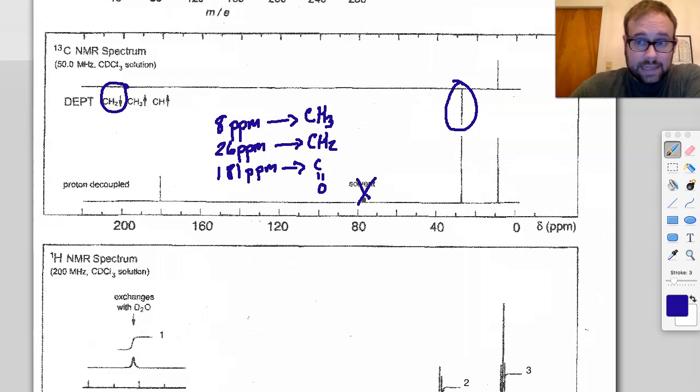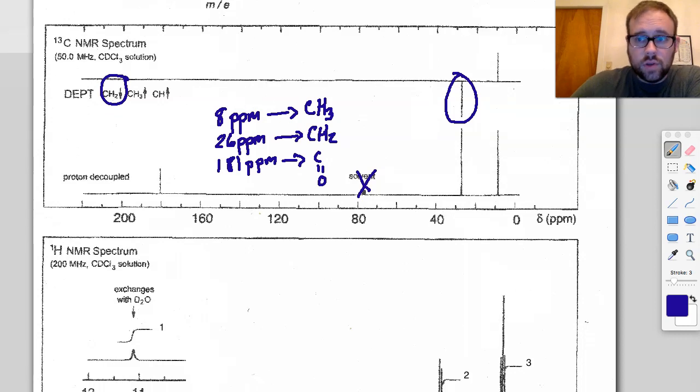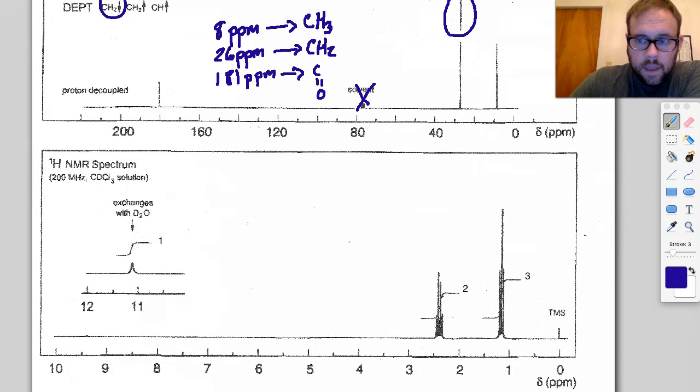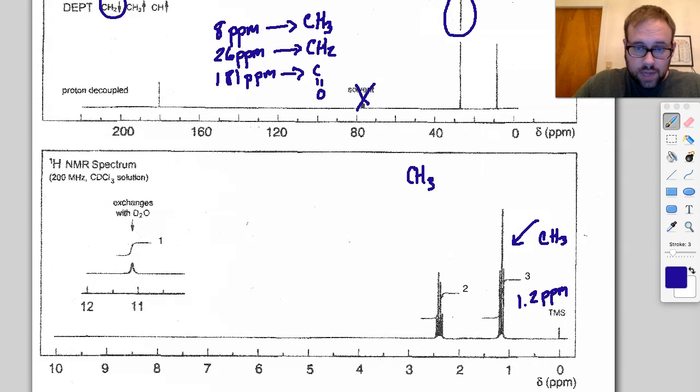The final push for the carboxylic acid and confirmation will come from the proton NMR, because a carboxylic acid will have that acidic proton that is very easily seen on the proton NMR. For the proton NMR we can see three peaks here. The first one is this one right here that integrates to three, that would be our CH3 group. This might be about 1.2 ppm. It is integrating to three, implying that it would be a CH3, and if you take a look here, this is a triplet. If it's a triplet, it means its neighbor must have two protons, so that suggests it's a CH3. The triplet means that it's next to a neighbor with n+1 protons, so two plus one is three making the triplet, and that is CH2.